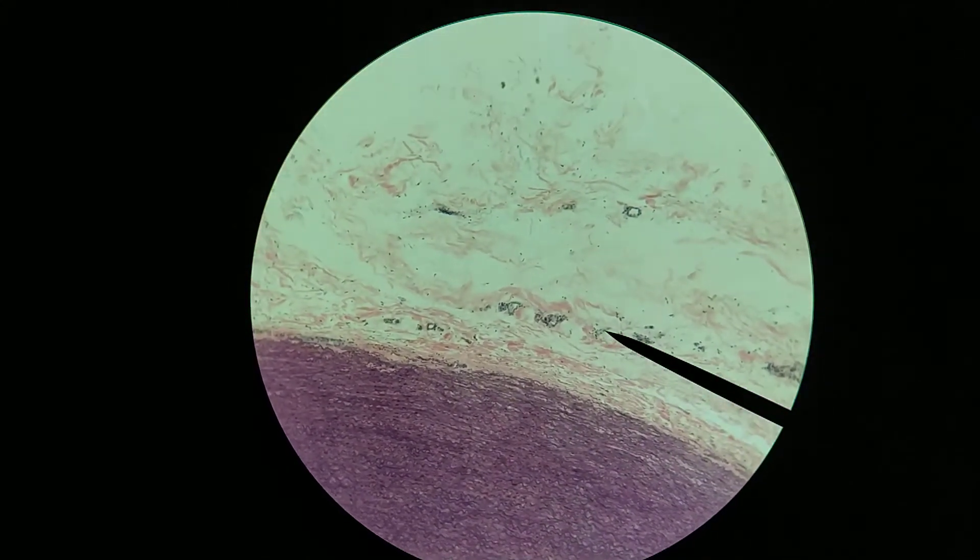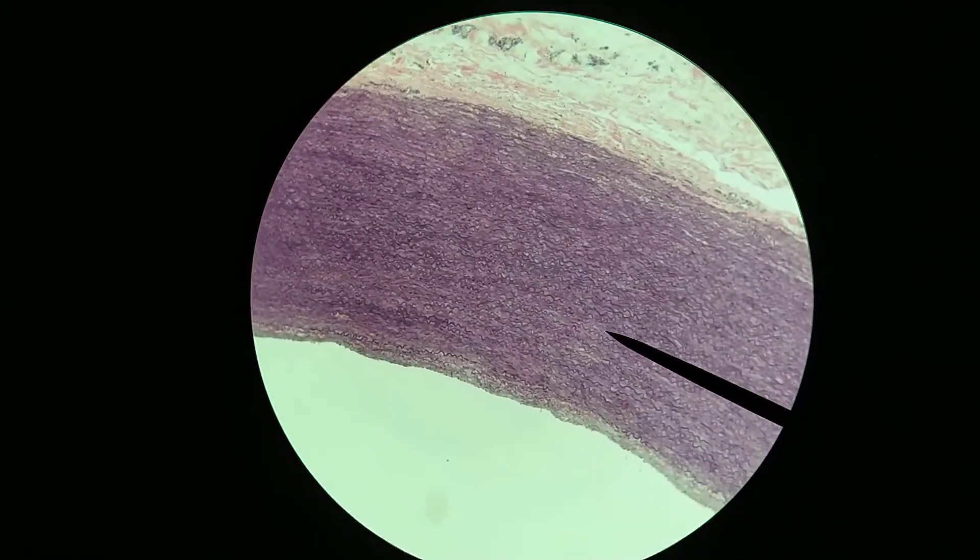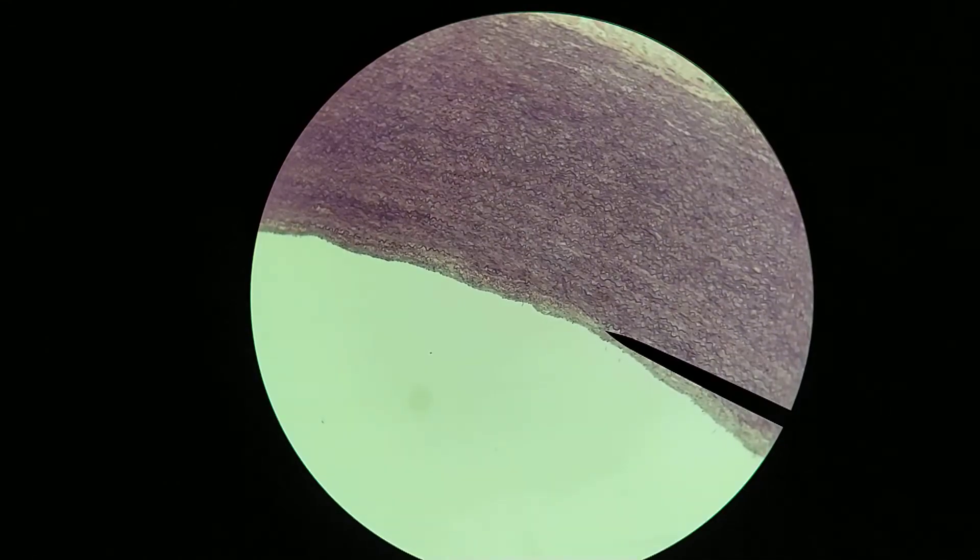And then the tunica adventitia around the outside, a much thinner layer. And again, this is an artery, so the tunica media is really the main layer, the thickest layer of this particular blood vessel.